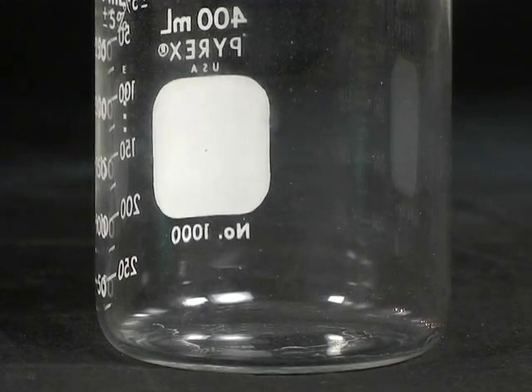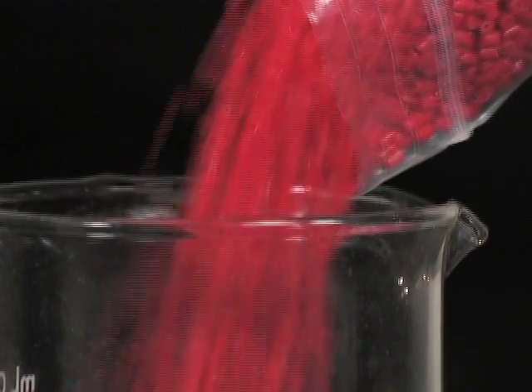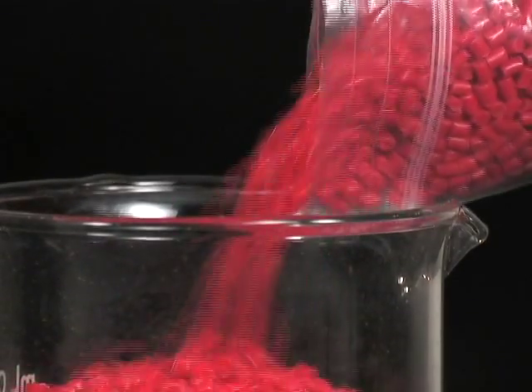However, pellets are frequently translucent and non-uniform in size. This makes it important to average several samplings from each batch.